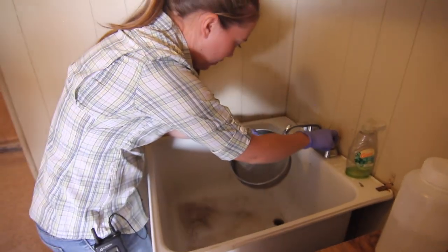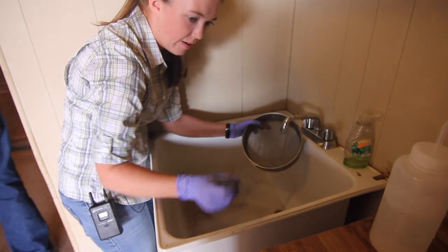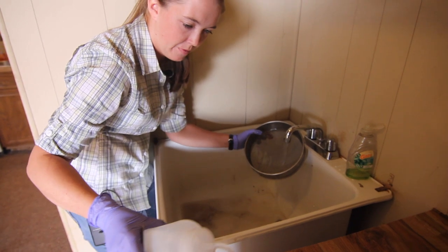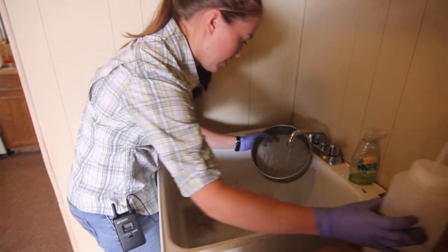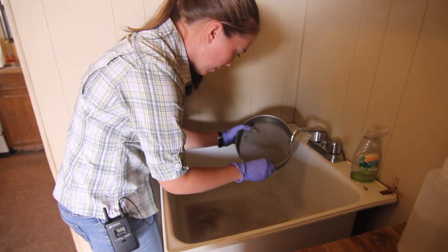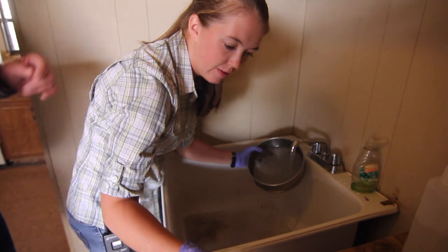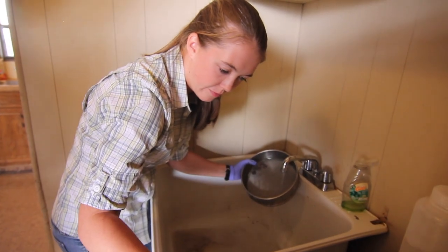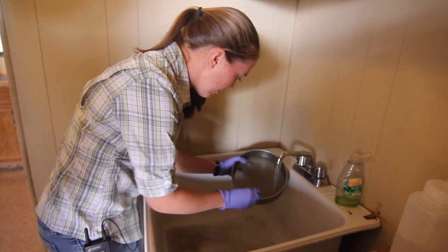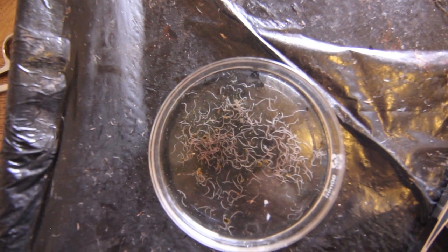And then I'll wash everything down into here and get my petri dish, get some water, and then I'll just grab all my worms. I typically like to do it under the running water, because if they start to dry out, then they'll just stick to the sieve, so it's easier to grab them this way.